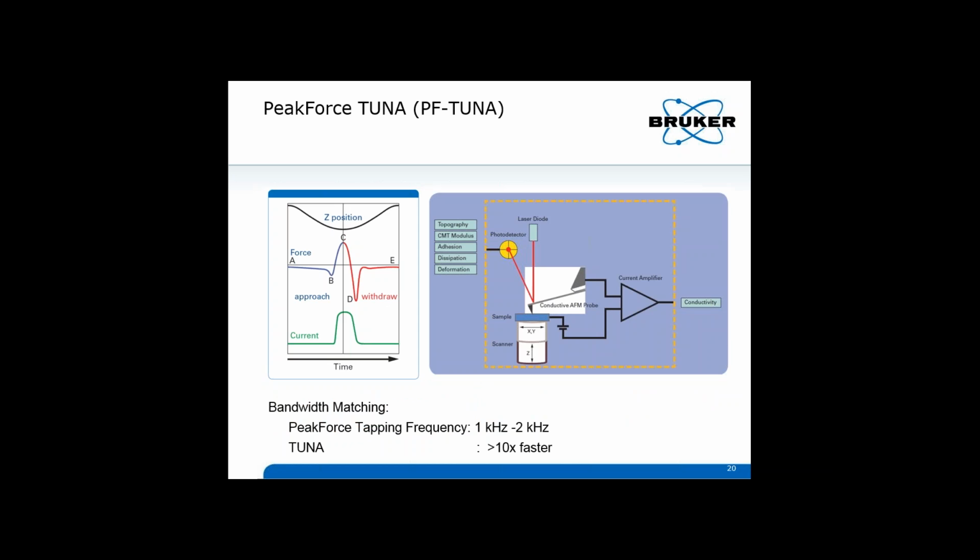Before we talk about the alternative solution of the development, we need to look into the requirements of the AFM-based conductivity measurement techniques. What's the requirement? The first one will be better force control. As we discussed earlier, the contact mode has high shear and normal force, resulting in many issues. The question is, how about we use tapping mode? Because you all know that tapping mode gives less force compared to the contact mode.